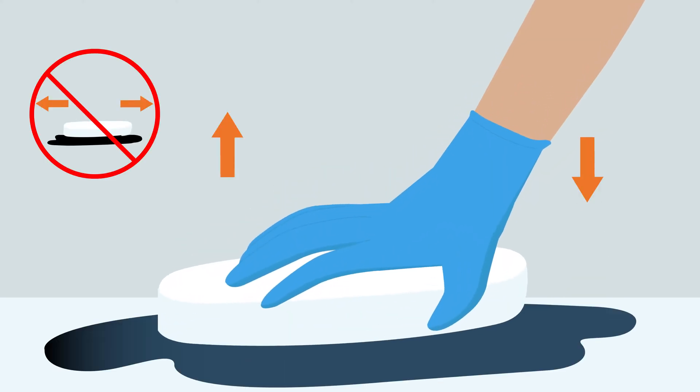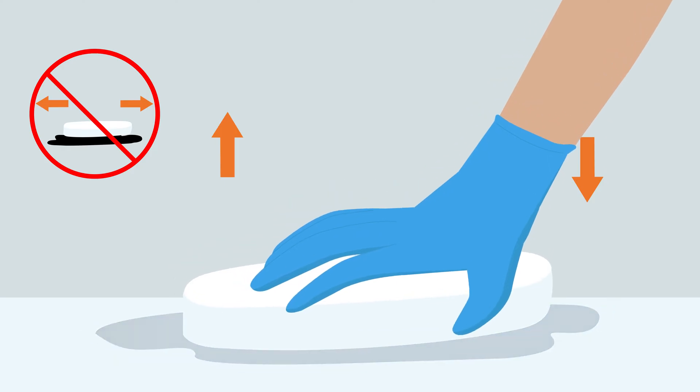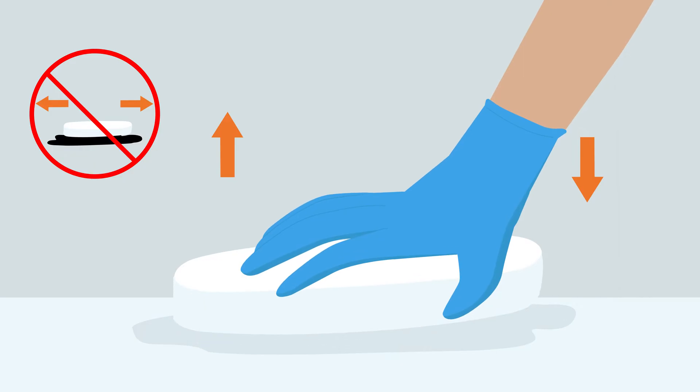Use the pad to absorb spillage, placing on the spill and dabbing the area, not scrubbing. Dispose of pad when spill has been absorbed.